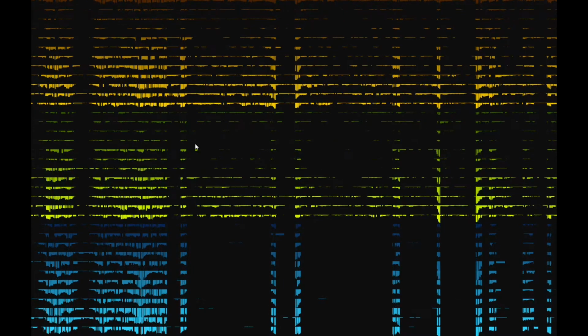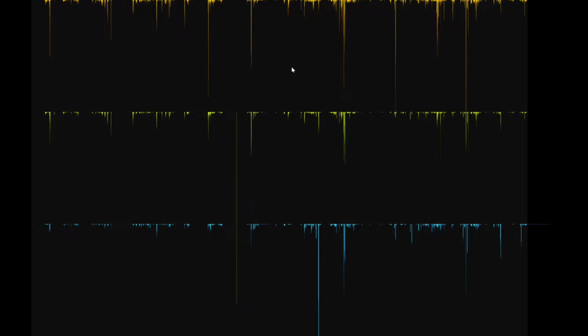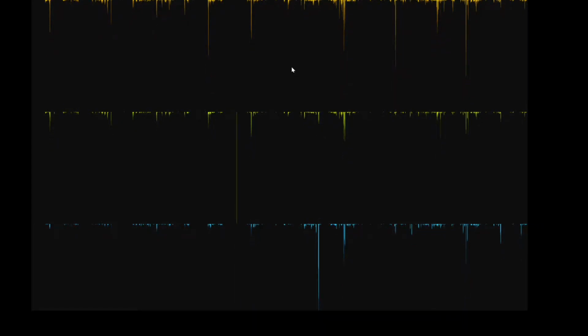hours after bacterial exposure. Even at this prototype stage, the Cheetah Genome Browser can be used to perform tasks virtually impossible with currently available tools. For example, let's find genes that are activated upon encountering bacteria. We will superimpose the corresponding graphs with time point 0 at the front and time point 120 minutes at the back. Since time was represented in increasingly darker shades, the genes that are being activated now appear darker than the rest, and we can easily spot several of these here.